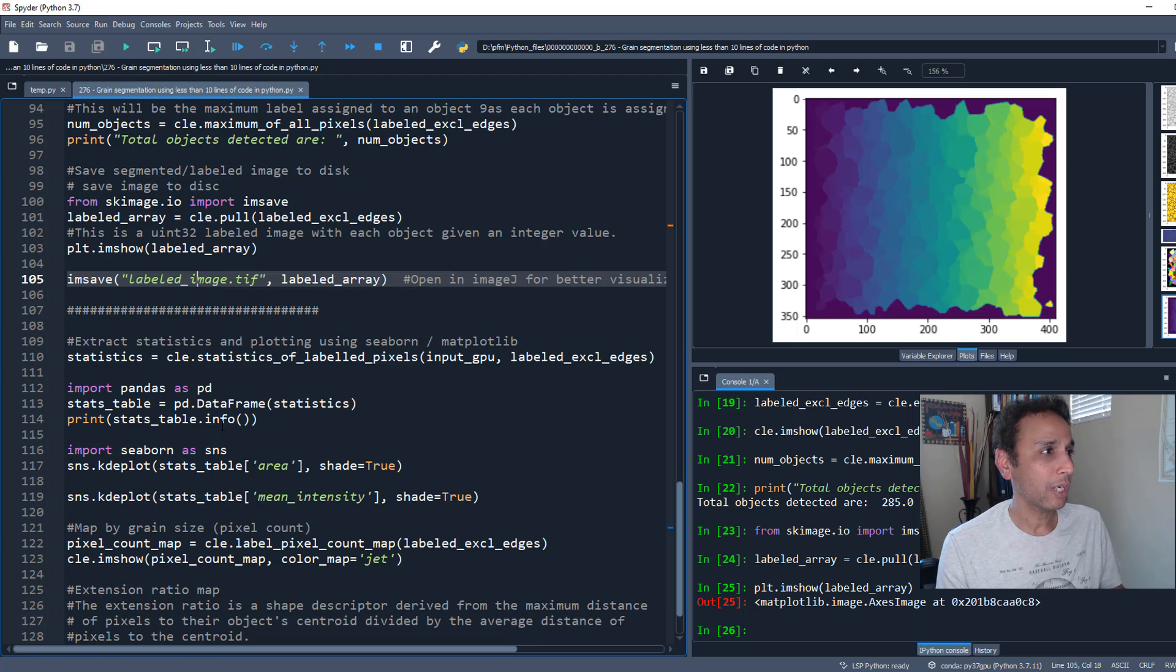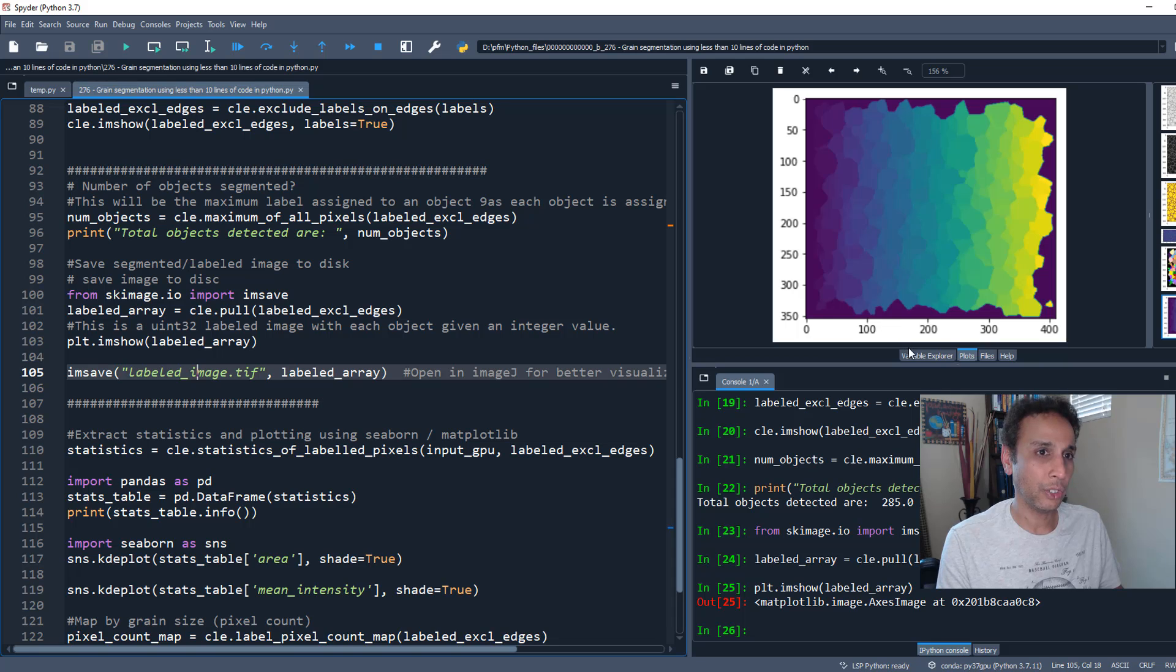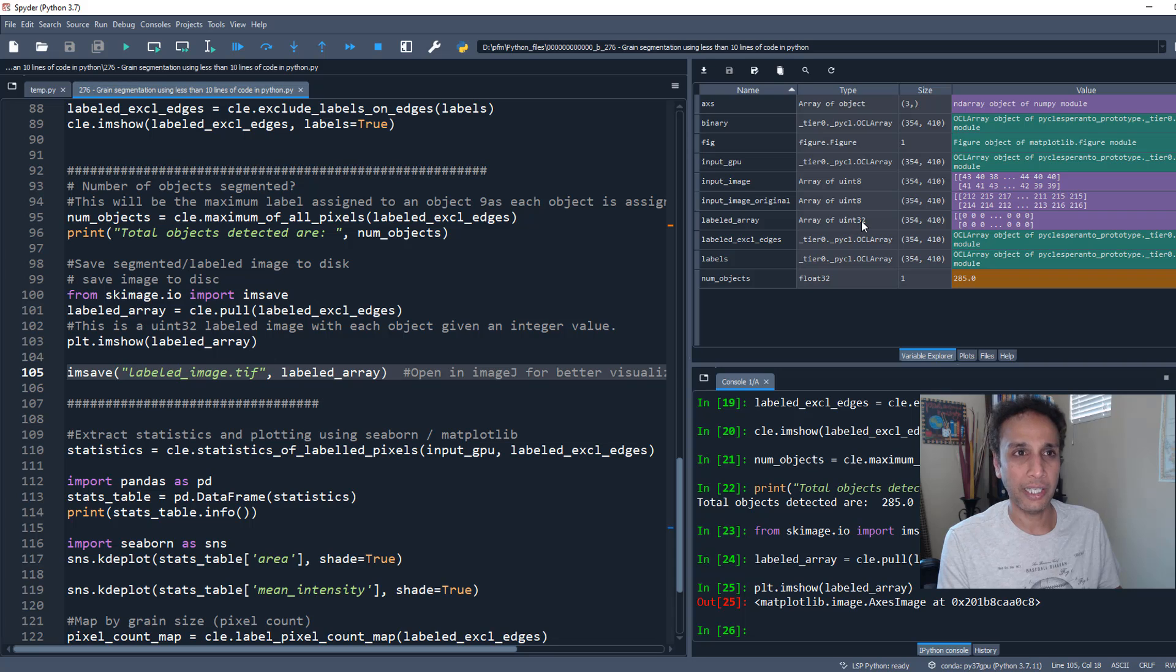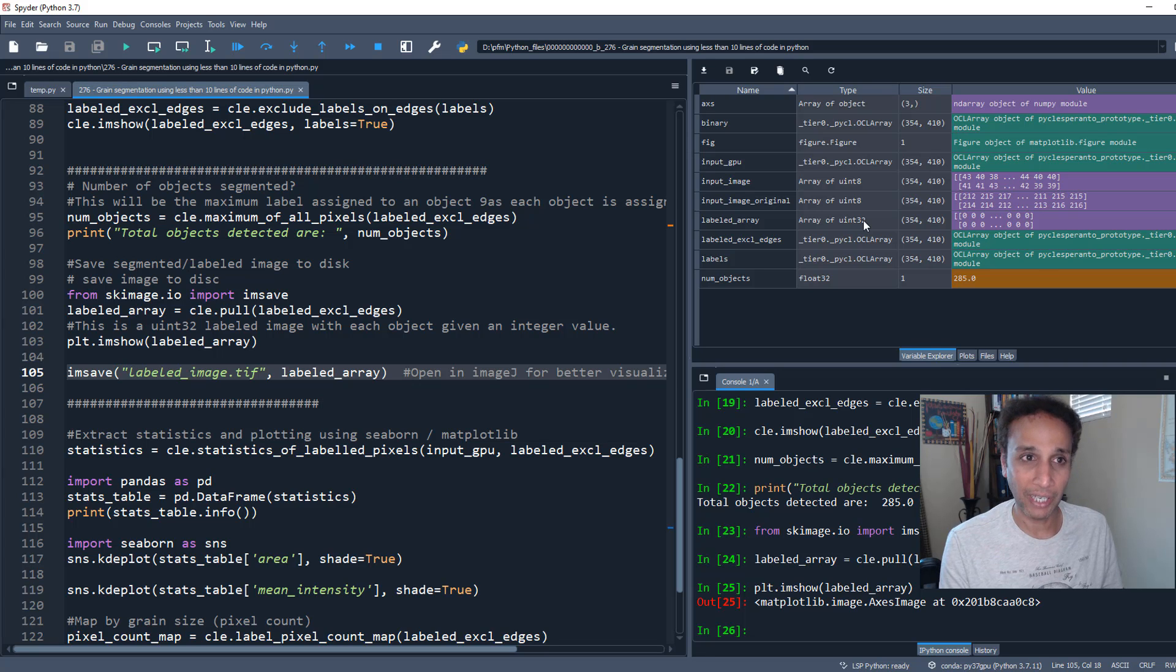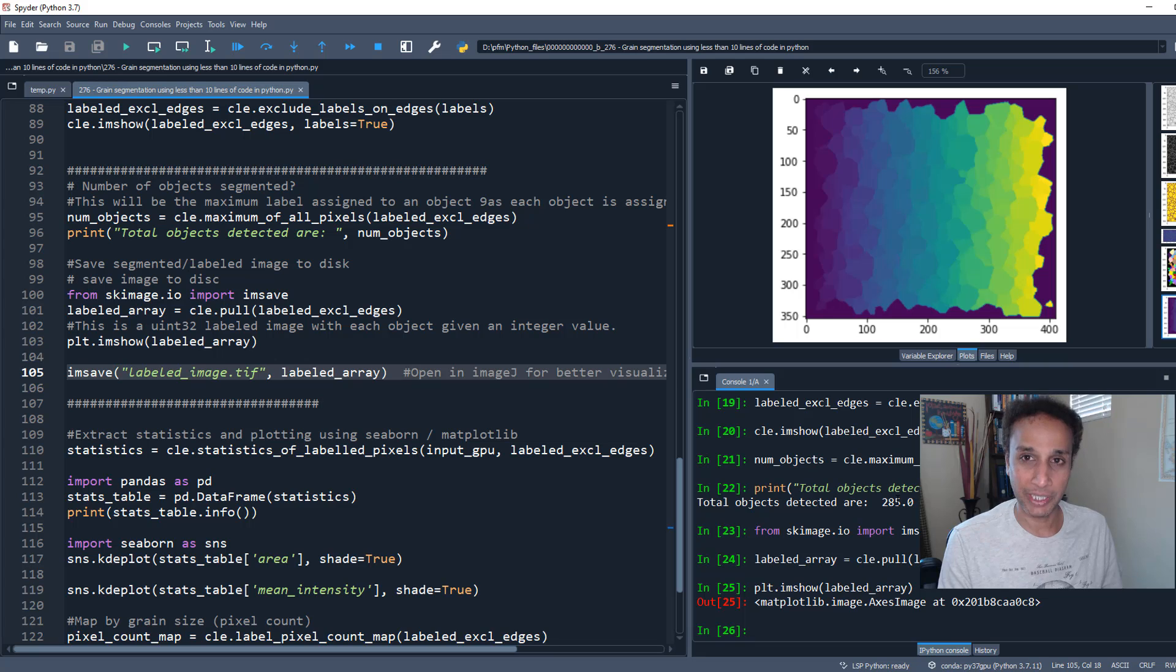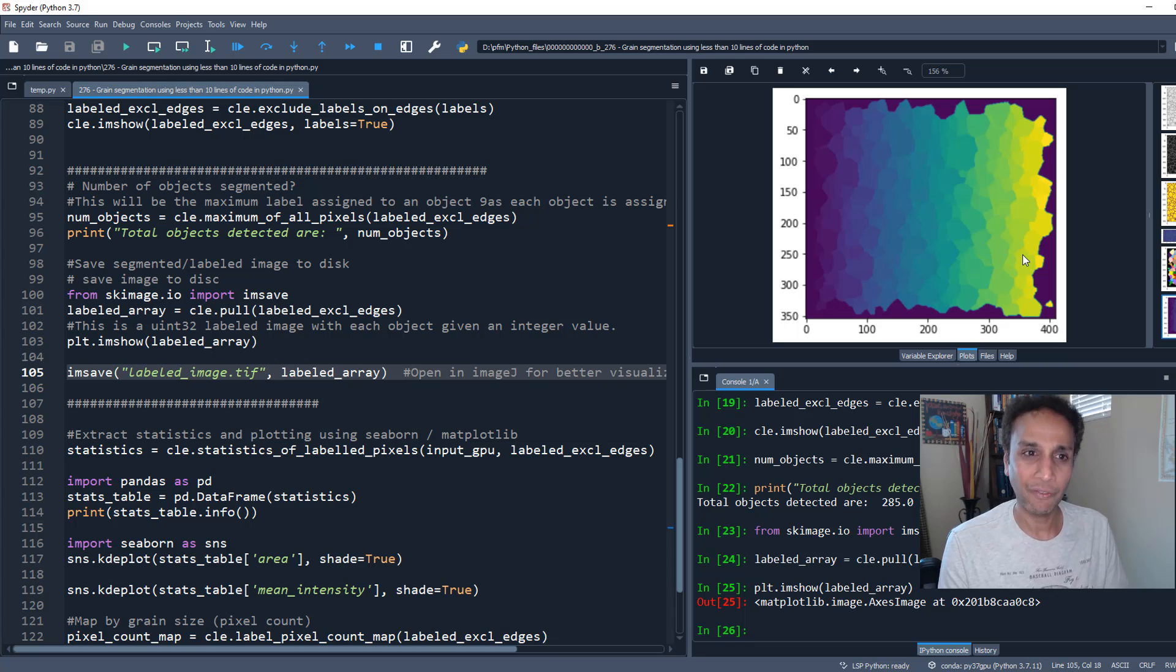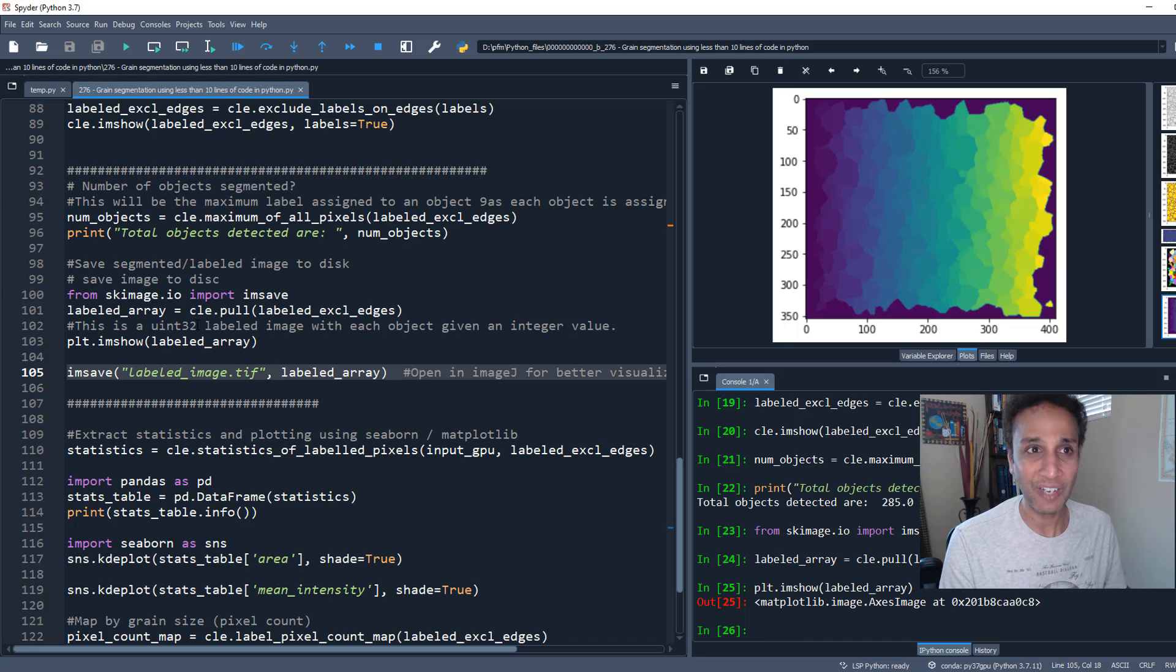I can save this image locally. Another note: this image is unsigned integer 32. If it's unsigned integer 8, the maximum value is 255, but we have 285 objects. We don't want all objects above 255 to be given value 255. That's why we have unsigned integer 32 - the maximum number of objects can be 2 to the power 32.